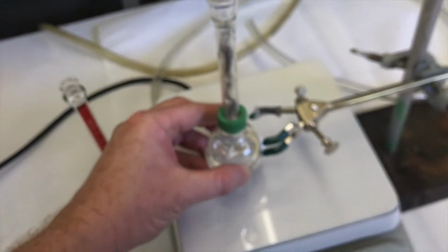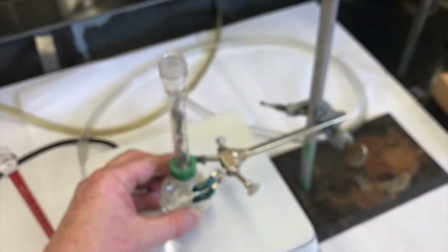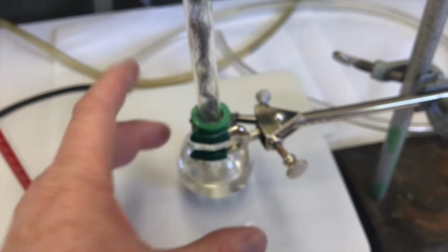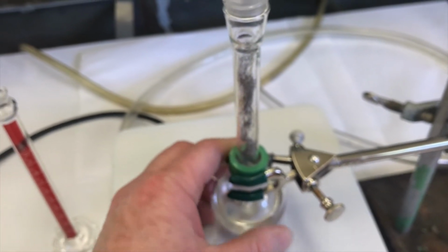I'm going to clamp this onto my hot plate, the ring stand, the extension clamp. Notice I added my clamp, I grabbed onto the lowest part. I grabbed onto the round bottom. I like to hold onto the lowest thing, then everything above it is held by gravity in case something goes wrong with the attachment.